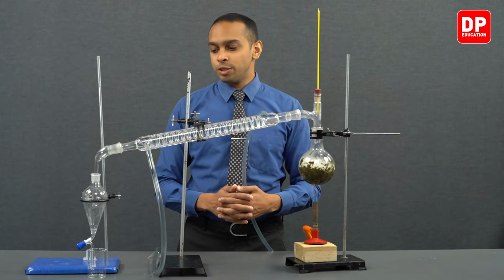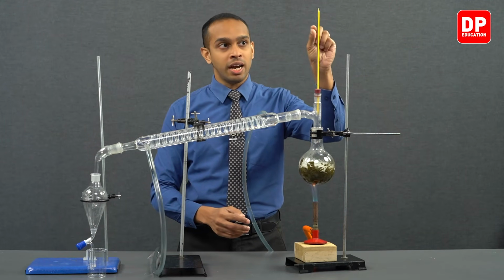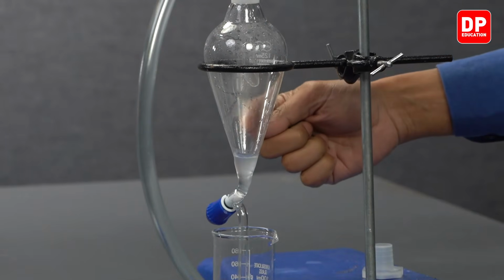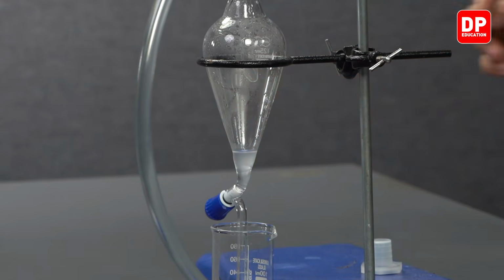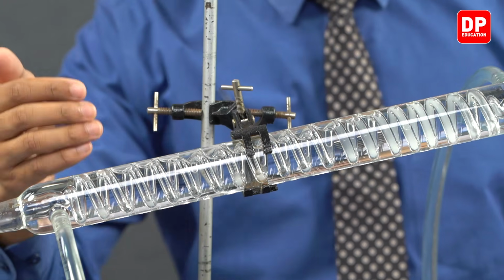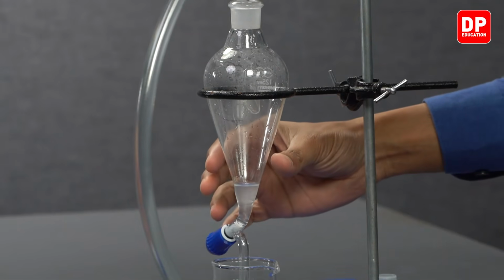Now students, as you can see, when we keep heating this mixture, the temperature still remains at 99 degrees Celsius. It doesn't go above 99 degrees Celsius. And we can see the liquid is slowly getting collected into this separatory funnel we have over here. As the vapor enters the condenser, the condenser will cool down the vapor, and little by little you can see the vapor will turn into a liquid and get collected in our separatory funnel.